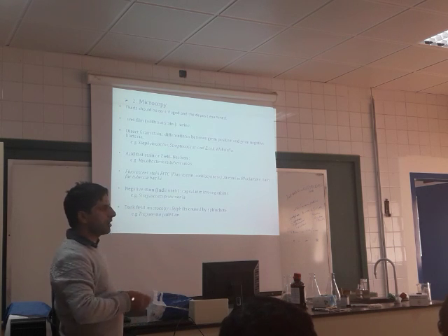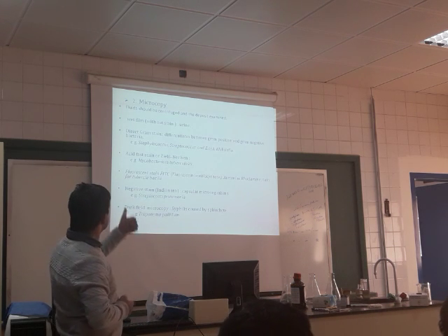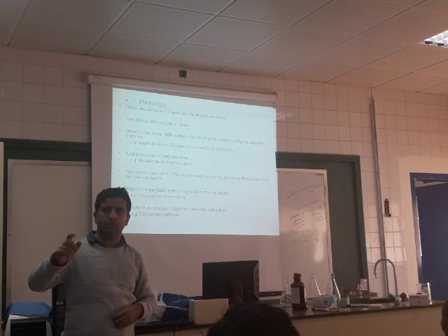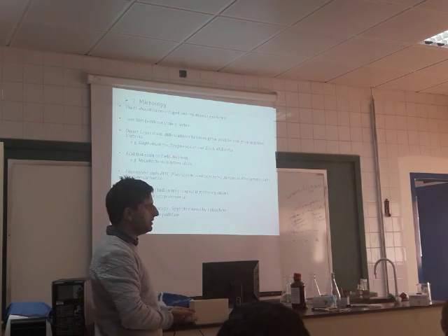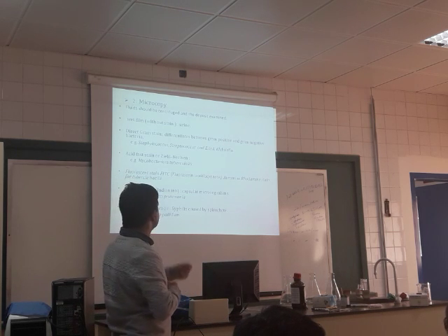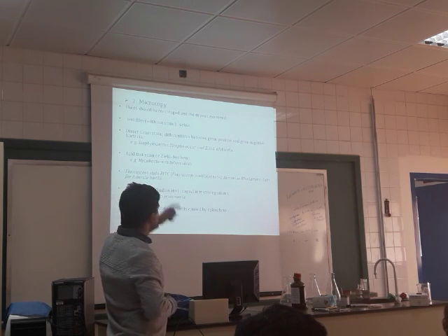So now we come to microscopy. In the microscope, first, if you have urine, you centrifuge it, collect the sediment and check under the microscope, after staining, whether cells or bacteria are present or not. Second is the direct Gram stain.